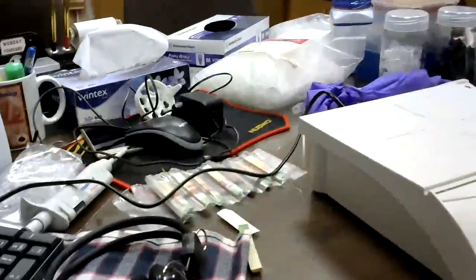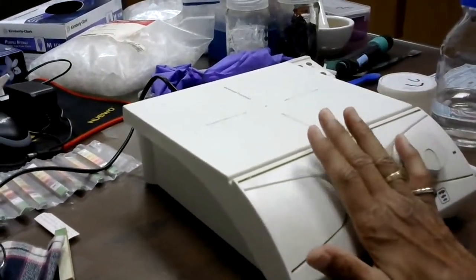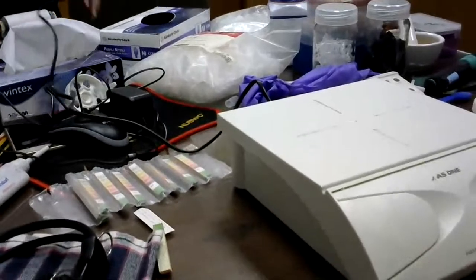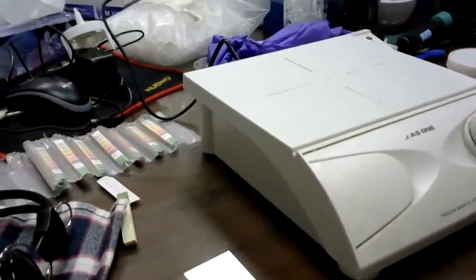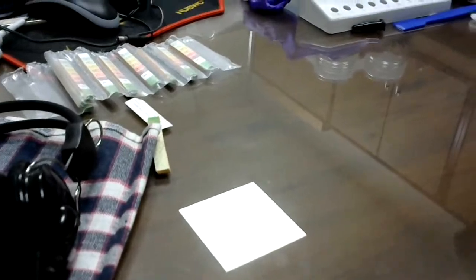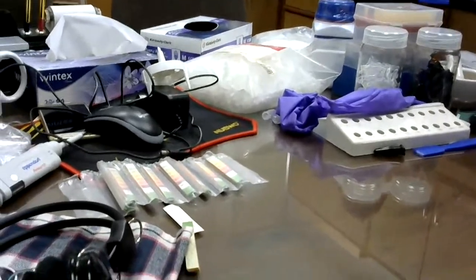Okay, so this magnetic stirrer is only stirring. There are magnetic stirrers which can heat as well as stir. Take out all these things and bring that one. So heating plus stirring.